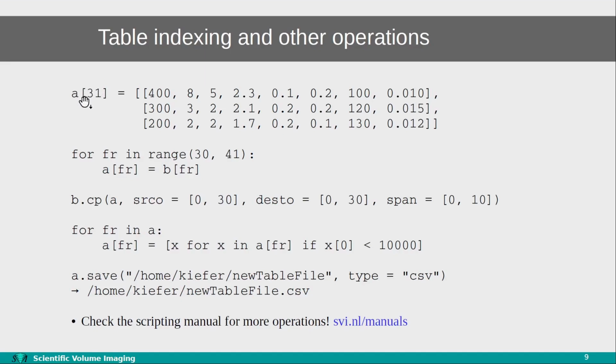So as I mentioned, you can use this index linearly, in which case it will simply be the frame, but you can also use two variables, and if you do that, it will be a channel and then a frame. But in most cases, localization images will only have one channel, so you can just specify one number and it will just be the frame.